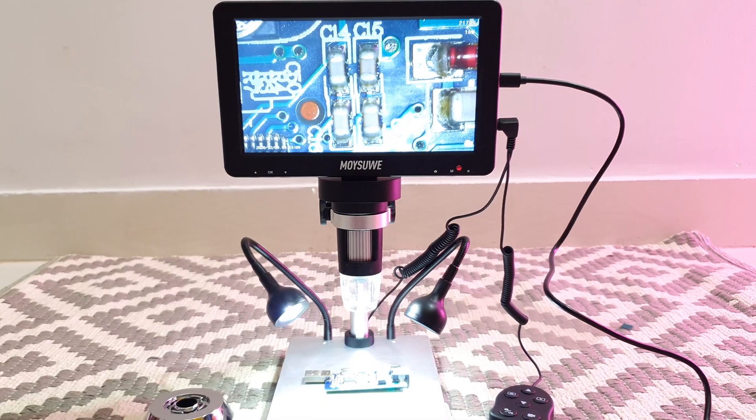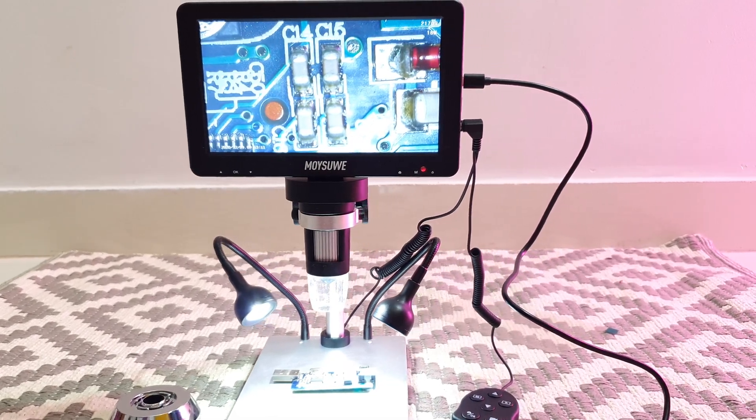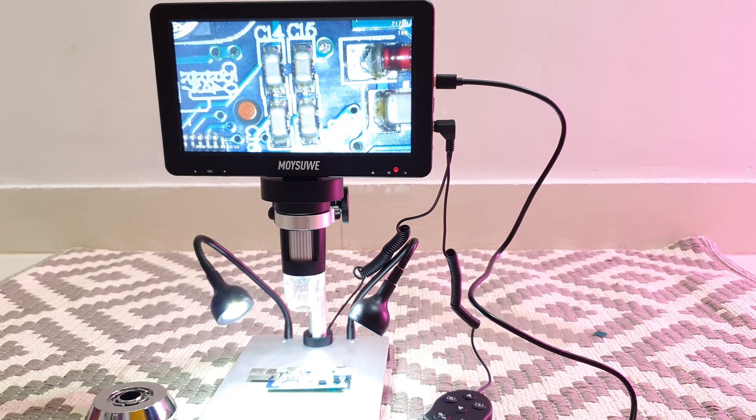This is the Moisoovay microscope and we're going to review this. Welcome back to Artic.